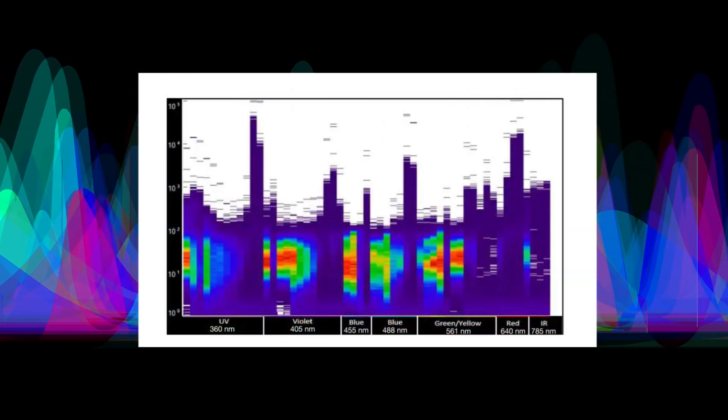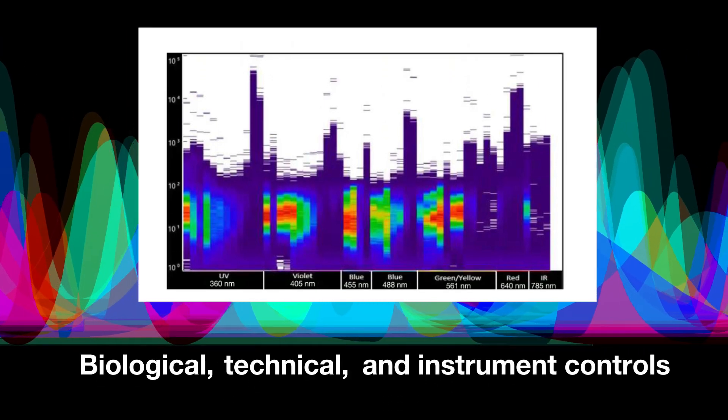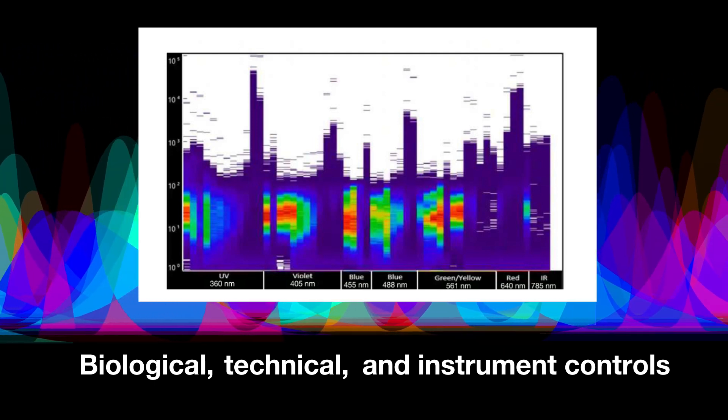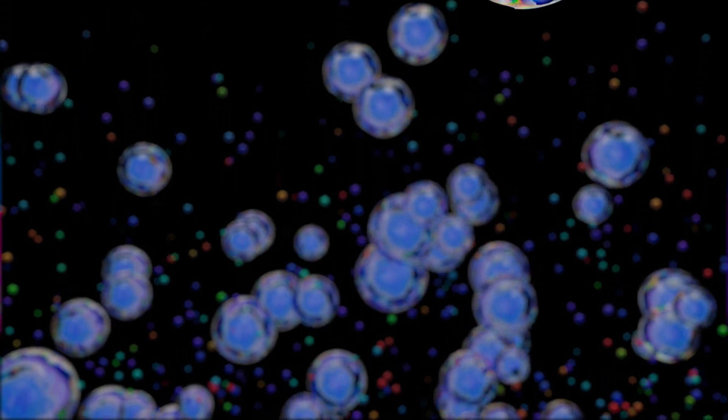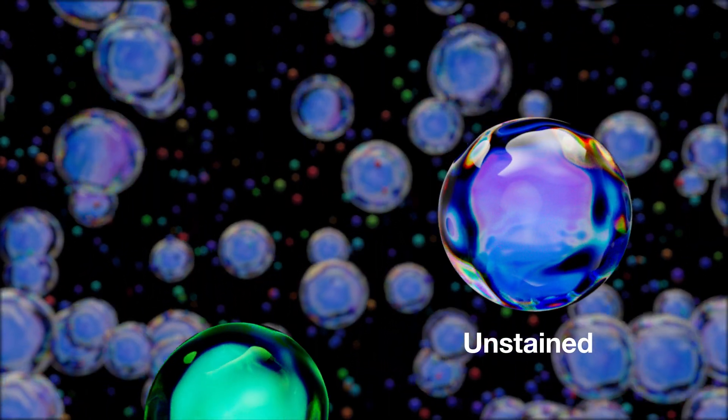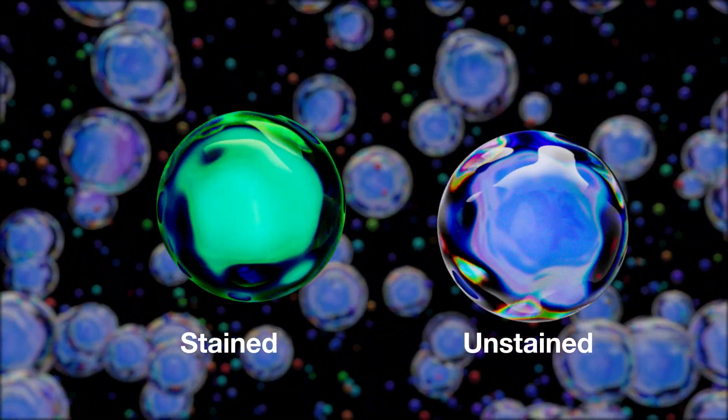Like in conventional flow cytometry, biological, technical and instrument controls are necessary to validate the success of a spectral flow cytometry experiment. Unstained samples treated identically to stained samples are used in both conventional and spectral flow cytometry to determine autofluorescence.